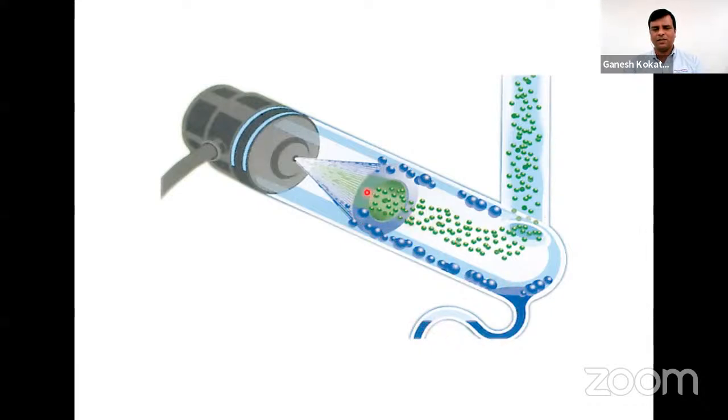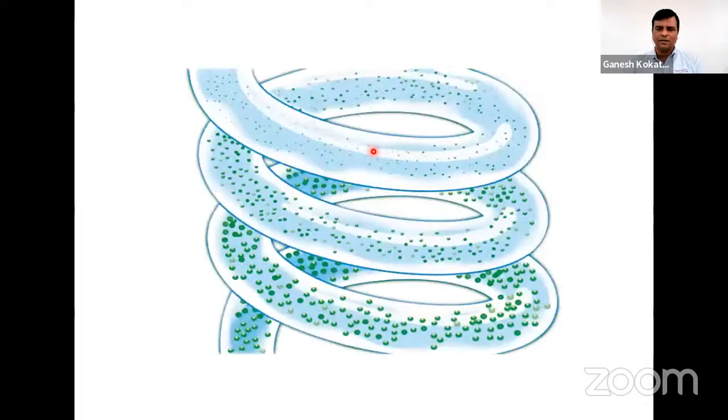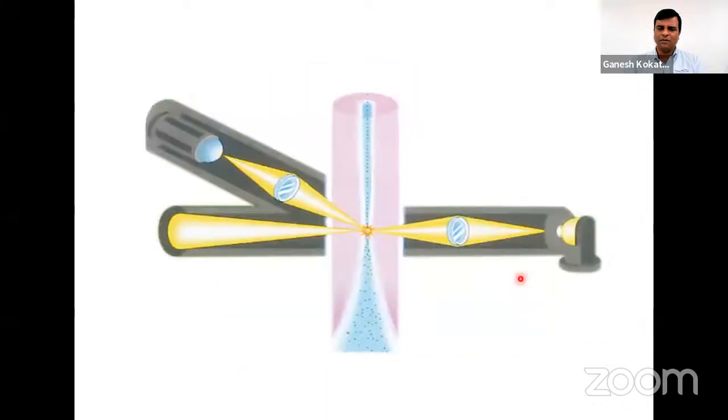After formation of the spray, some of the larger droplets get drained out, but some small particle size droplets move along with the nitrogen gas towards the drifting coil. In the drifting coil, we apply a certain temperature where the surface tension of the droplet increases, and at last it forms a blast, and whatever vapors are formed all get evaporated, and only some component of the molecule passes towards the detector, where we apply a light source.